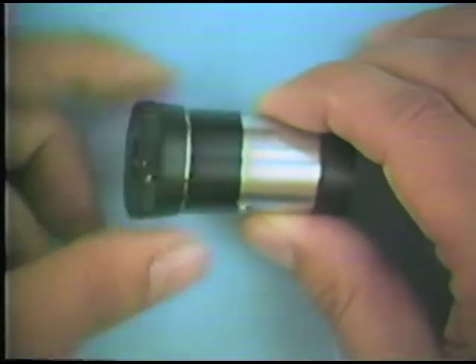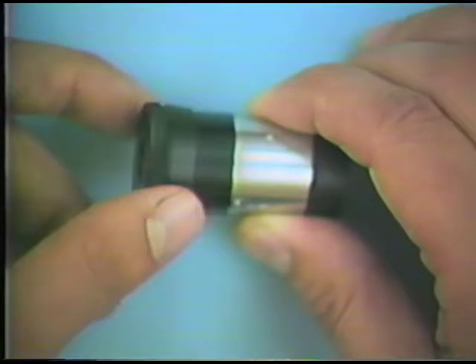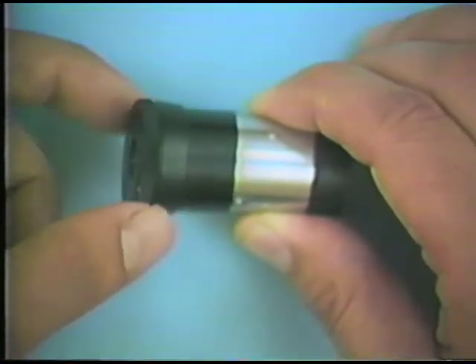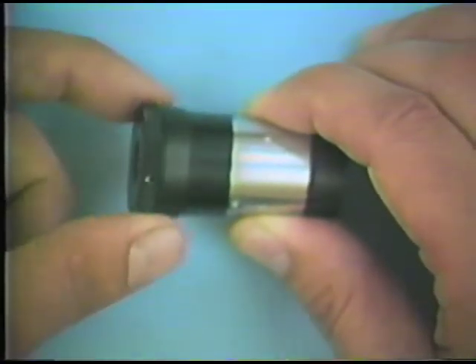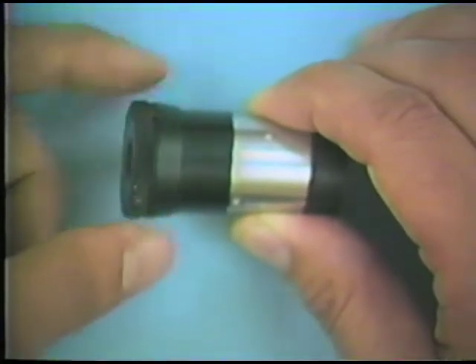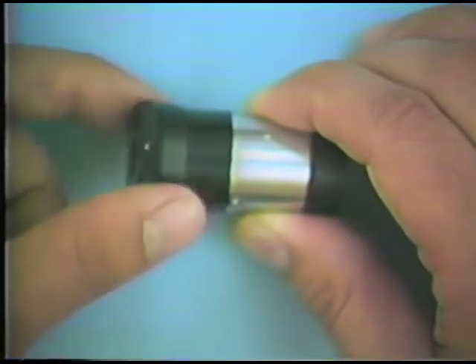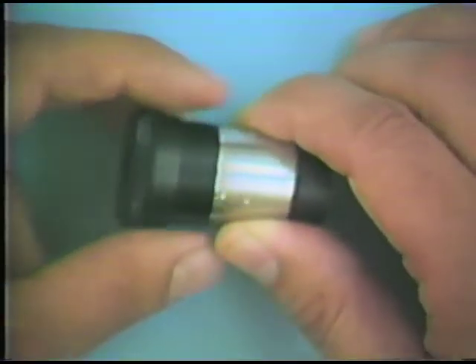There also is an adjustment in the eyepiece, or the ocular, which serves to focus the crosshair. Most oculars contain a crosshair, some contain grids, and some contain micrometers for measuring the scale of that particular eyepiece.